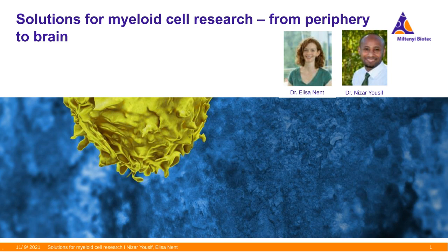Thank you. Next question. Why is it so difficult to isolate cells from the adult brain? As I tried to explain a bit in my slides, basically the older the mouse gets, or the older the brain is, the more vascularized it is and the more red blood cells there are. And also you have more neurons. This means more myelination around the neurons. In the end, you end up with more myelin debris and more red blood cells, and this can hamper your downstream applications.